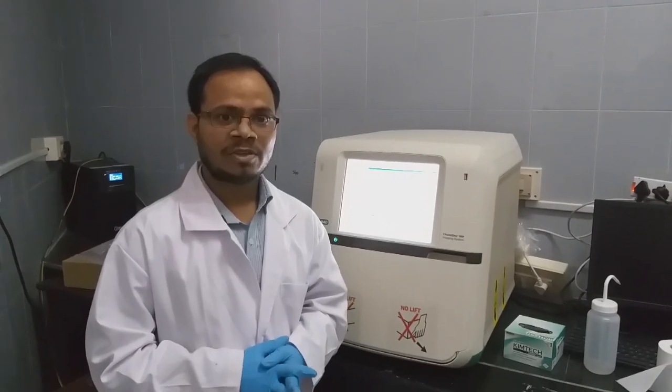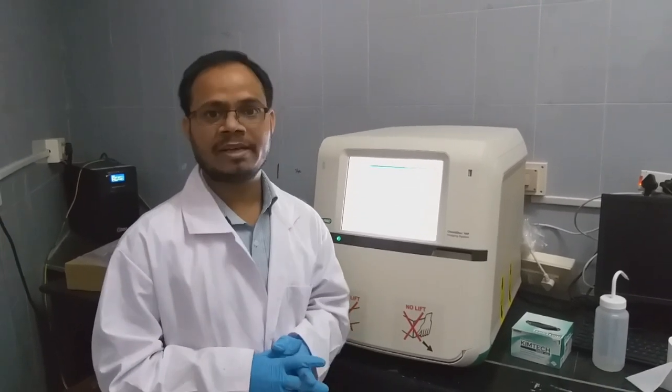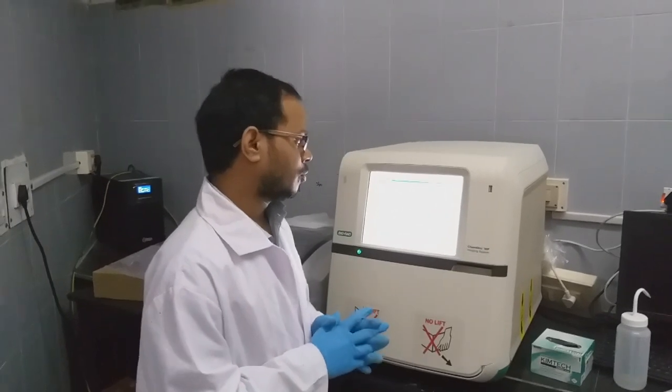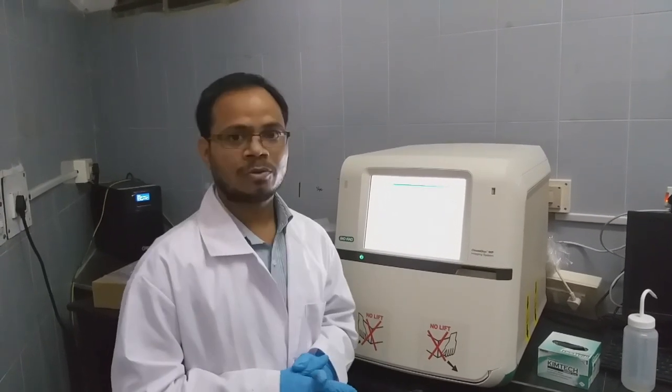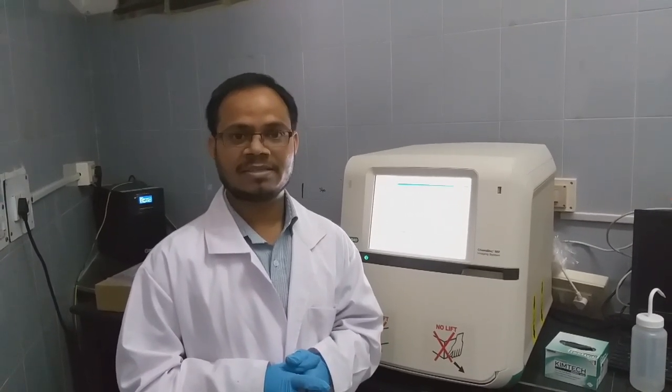In this video, we have learned how to prepare an SDS-PAGE gel and how to run it, what precautions need to be taken while preparing the gel, and how to observe and record the gel using a gel documentation system. I hope this will give you a gist of how to prepare and run an SDS-PAGE gel and analyze the protein sample.